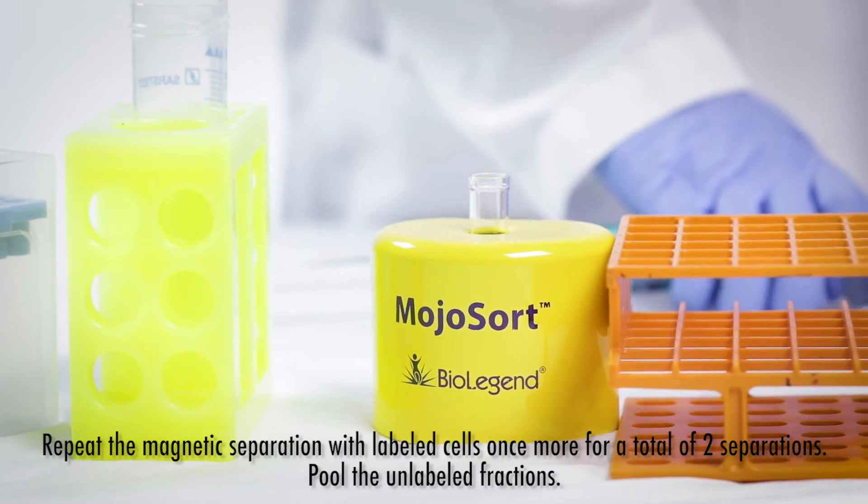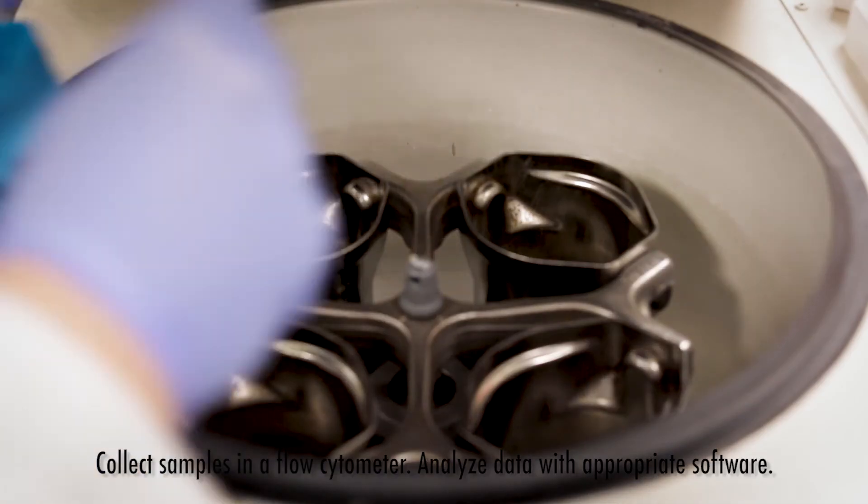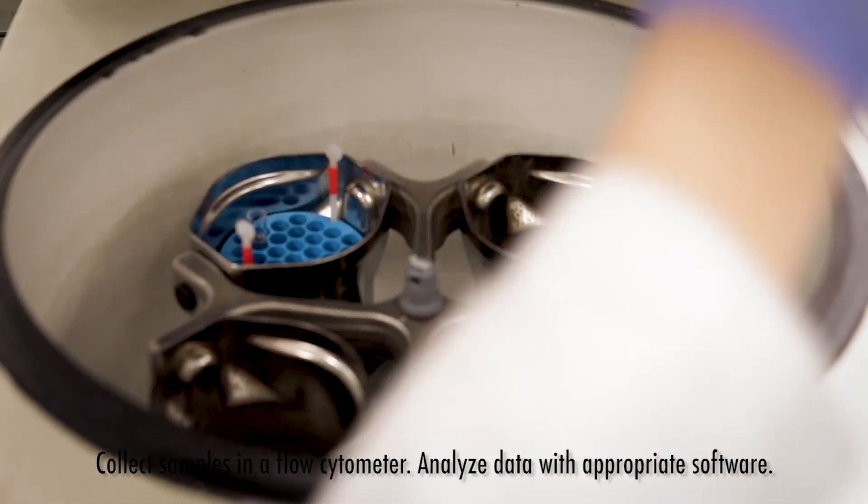Pool the unlabeled fractions. Samples are ready for downstream applications now.